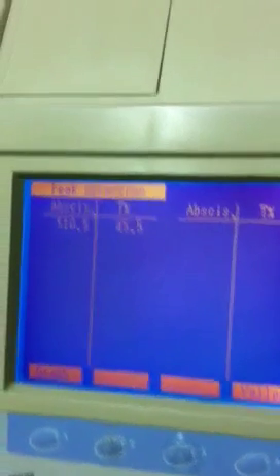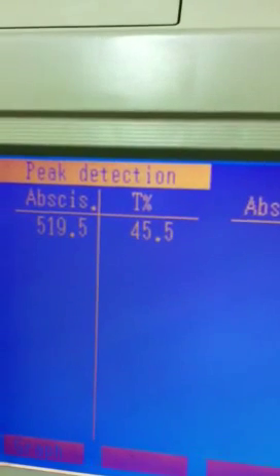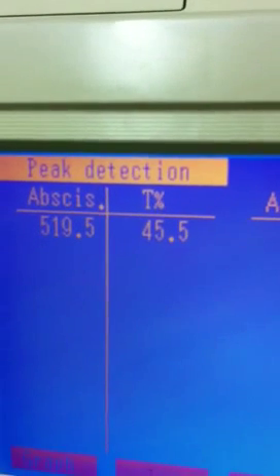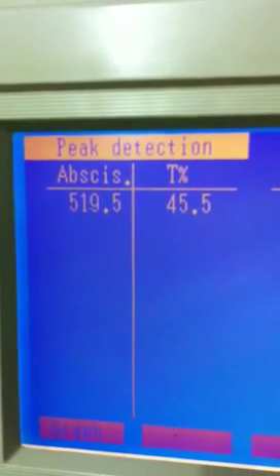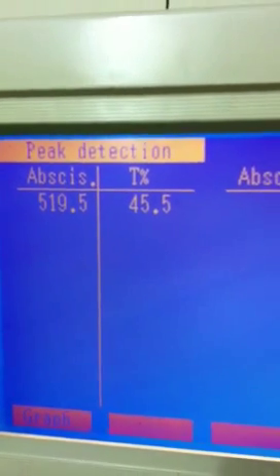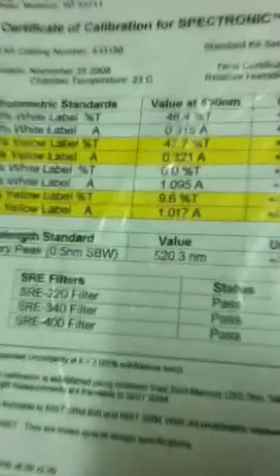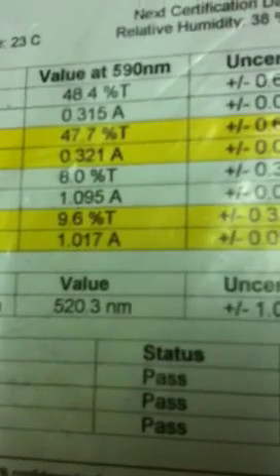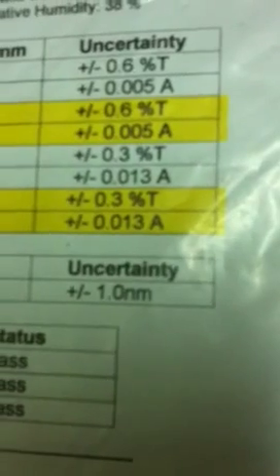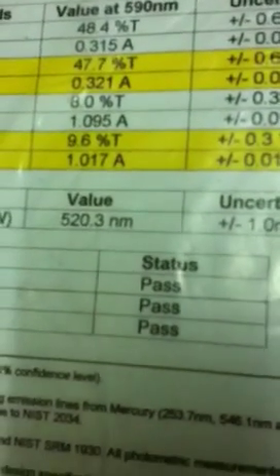And it showed you a scanning peak of 519.5 nm. Now as we could see the standard value was 520.3 and plus minus 1 nm so it's well within range.